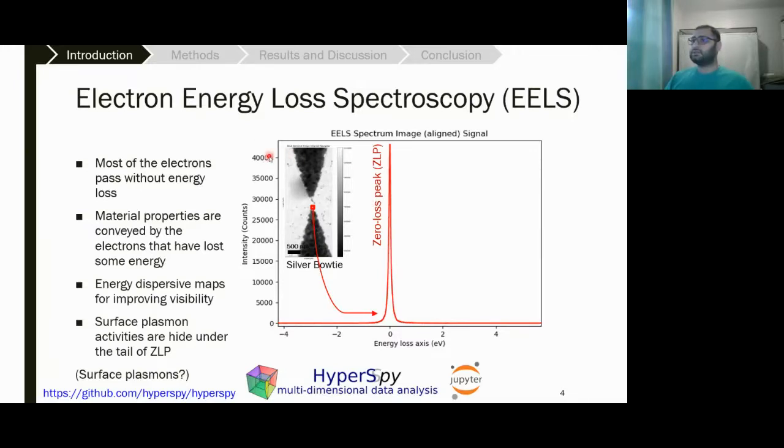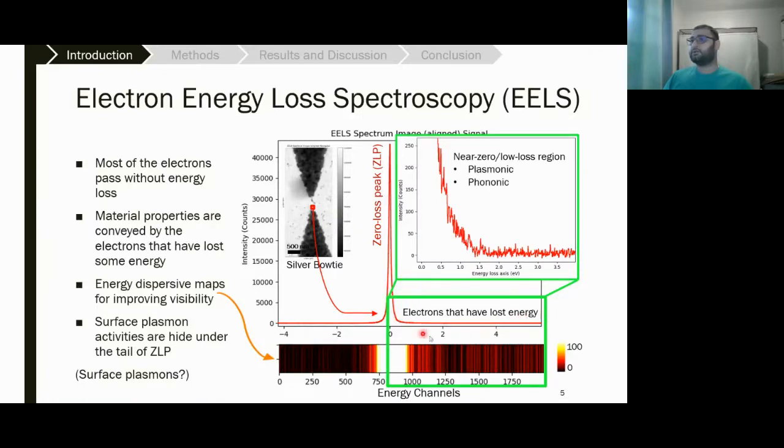This data is coming from experimentally obtained data. Here you can see we have a silver bow tie as a nano antenna. The spectra you can see here is coming from the pixel shown by this red box. All of the spectral analysis in this work is being done using HyperSpy software in Jupyter. The huge peak that you see here at the center is called the zero loss peak.